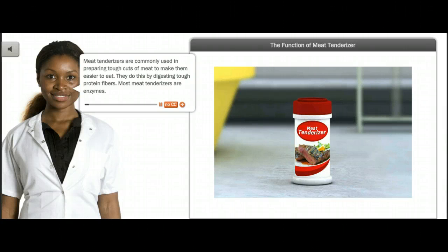Meat tenderizers are commonly used in preparing tough cuts of meat to make them easier to eat. They do this by digesting tough protein fibers. Most meat tenderizers are enzymes. In DNA isolation, meat tenderizer is used to break down the protein complexes that hold DNA in tight clumps. Digesting these proteins allows the DNA molecules to precipitate more easily.